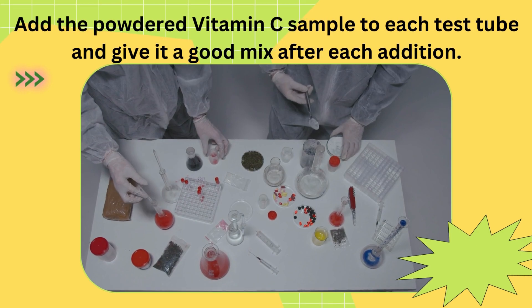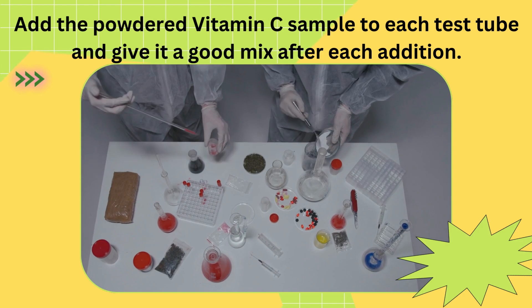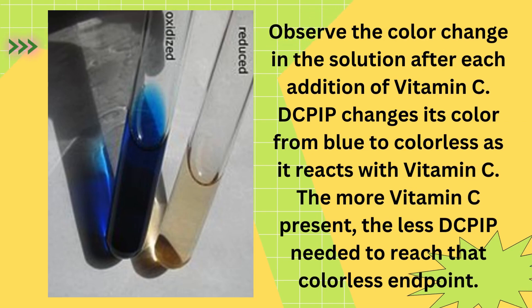Once that's done, it's time for the exciting part. Gradually add the powdered vitamin C sample to each test tube and give it a good mix after each addition. Observe the color change in the solution — DCPIP changes its color from blue to colorless as it reacts with vitamin C.